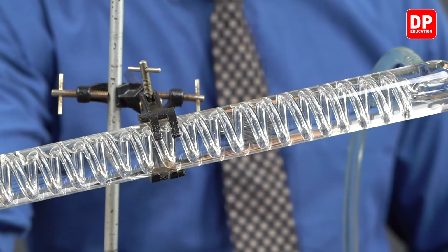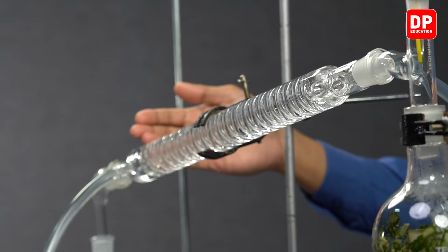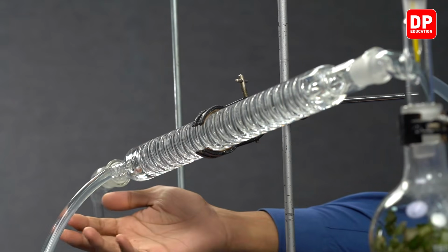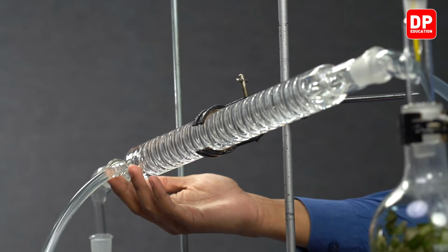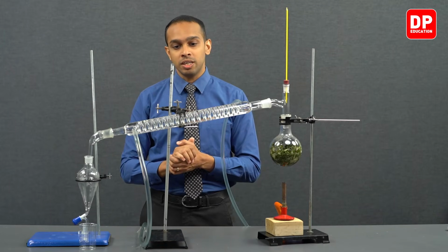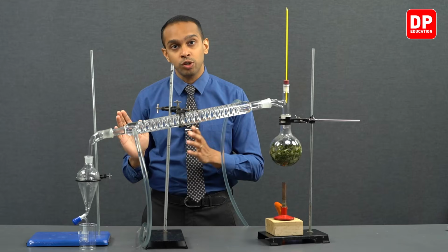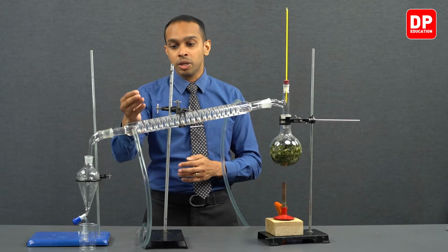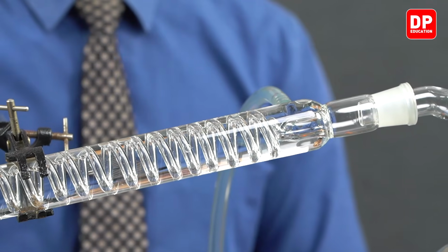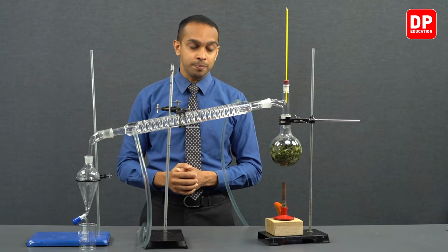We started filling it from this end and we saw that the water was filled from the bottom end of the condenser and was taken out from the top end of the condenser, and we have allowed the water to continuously run. We have not turned off the tap, so you can see water will be running from the bottom end of the condenser all the way to the top end throughout this experiment.